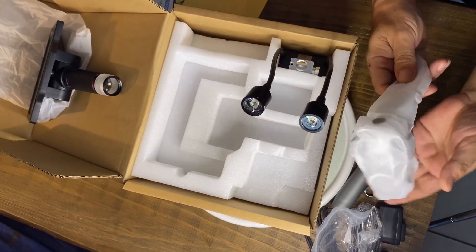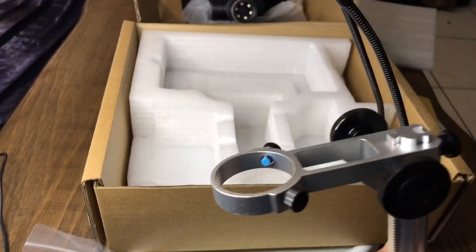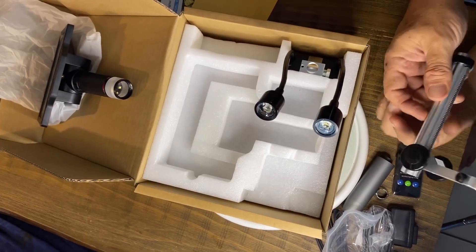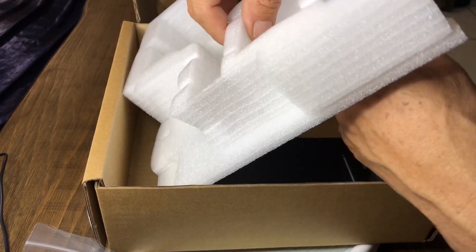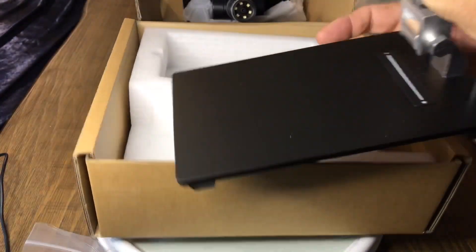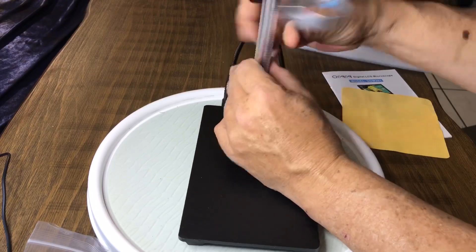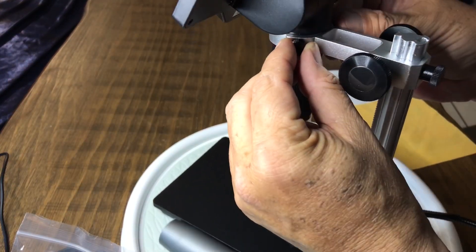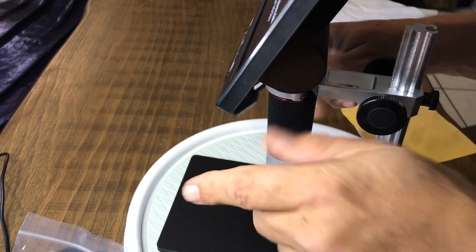Here's the stand to hold the microscope. Let's go ahead and take that out of its wrapper and set this up. It's got a nice extruded aluminum riser — not what I would call super heavy-duty, but heavy-duty enough. And then the last little bit is the stand, which looks nice and heavy. There are screws on the back that need to be adjusted to lock it in, and then this will rise up and down. You've also got a couple of lights that come around.